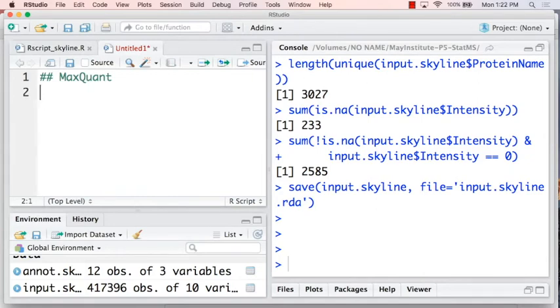How many people have you used MaxQuant before? Okay, so with MaxQuant, if you process everything under one output folder, they generate several outputs, like the evidence file, the protein group file, and the peptide group file, which summarize at the peptide level or protein level and so on. However, we are going to use the original one without any summarization, only the full feature level. So first, for MaxQuant, we need three files.